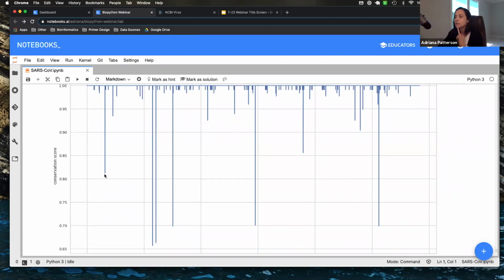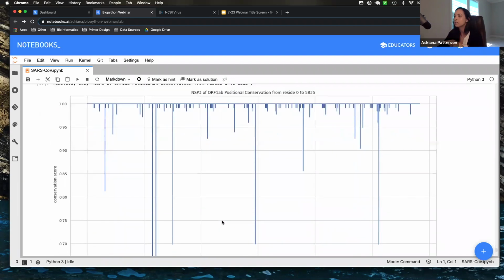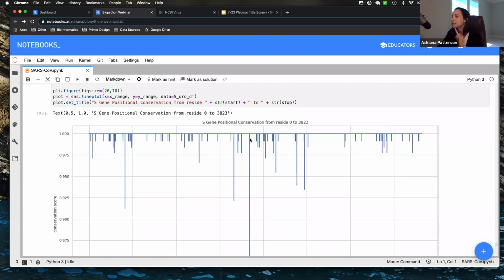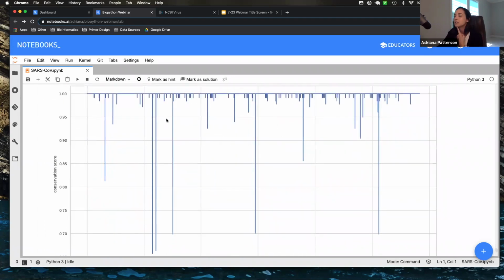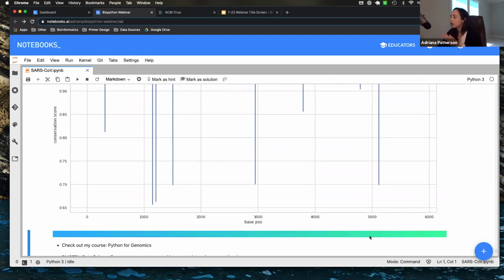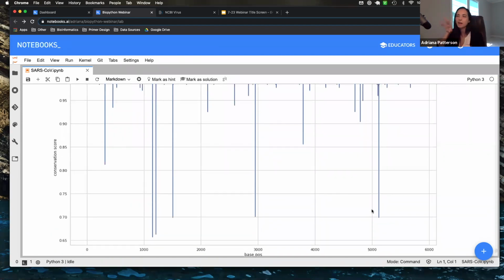And we can see that, compared to, no, this one should be more mutated. See, even I get confused sometimes. And so we can see that this one, no, it's less mutated. I don't know what I'm talking about. Yeah, see, this is tricky because this is a longer span of DNA. And so when I look at shorter fragments, I can kind of eyeball it.